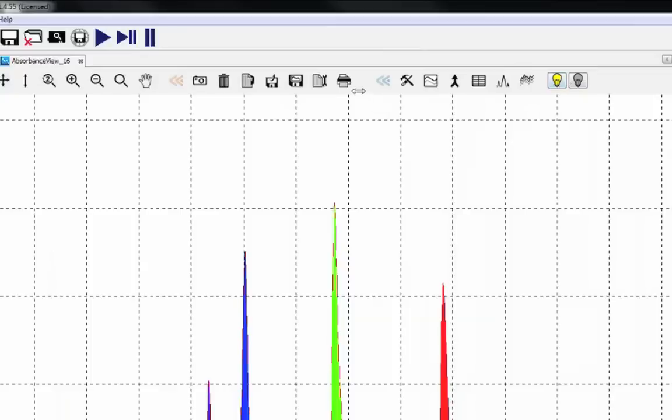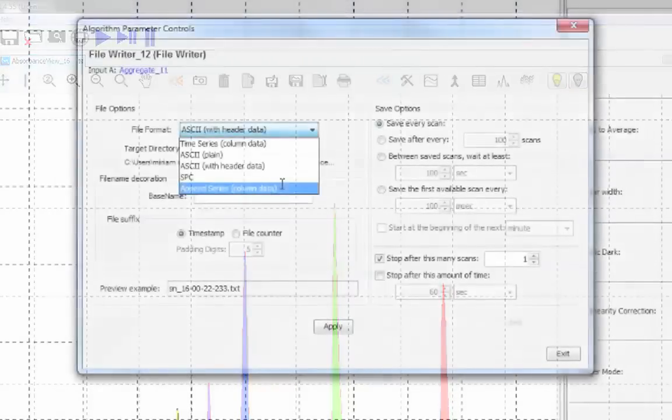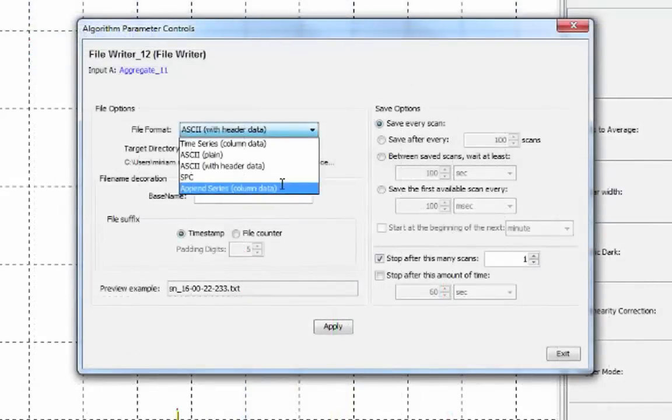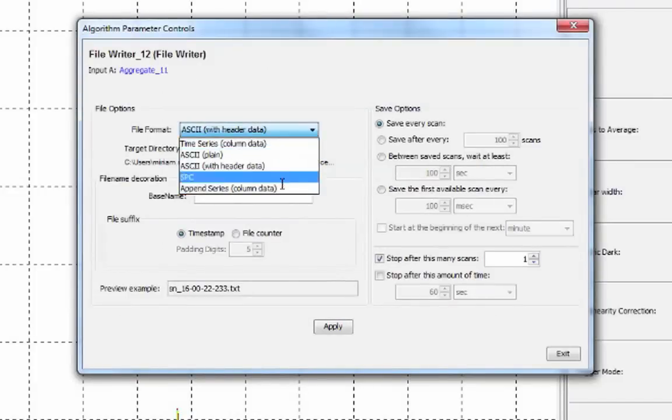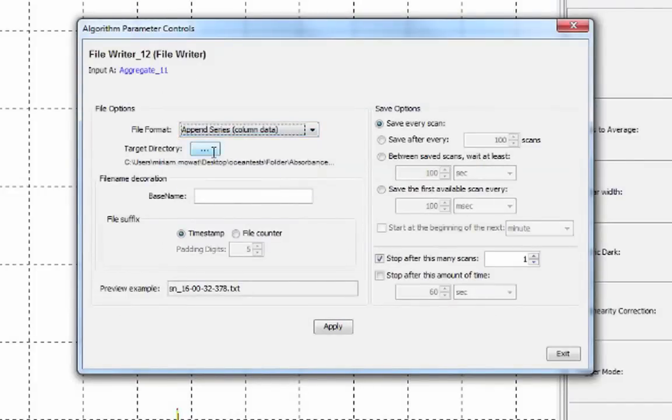To choose options for saving, go to the configure graph saving icon at the top of the screen. Here you can choose the file format you'd like to save in. Select the location that you'd like your spectra to be saved to.